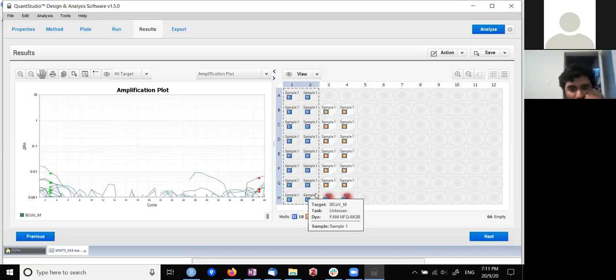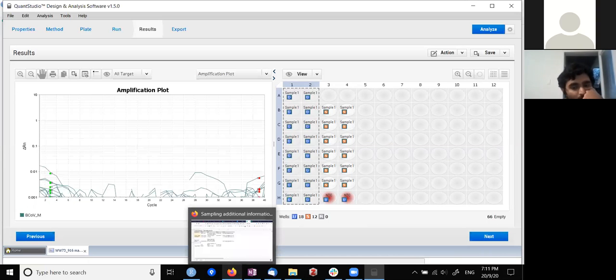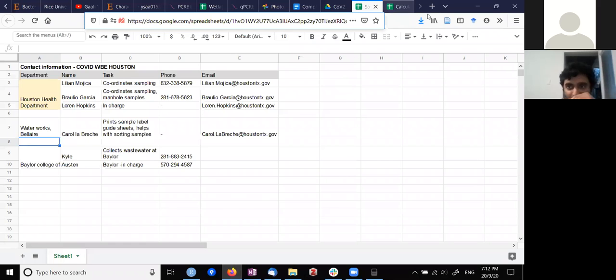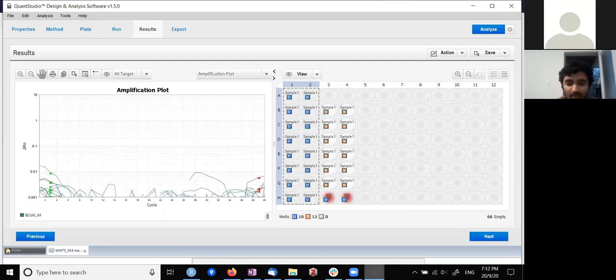So the ddPCR file gives you, like I saw up there, copies per microliter. So it gives you that, but you don't yet know if it's been amplified until you put it into the software. No, it is amplified. The droplets that we saw are what is generating that copies per microliter, but it seems lower than usual. I'm just wondering if there was some mistake during setting up the run. Usually in ddPCR, if you see droplets and it has run properly, there should not be any other issue. But the qPCR has not worked at all.